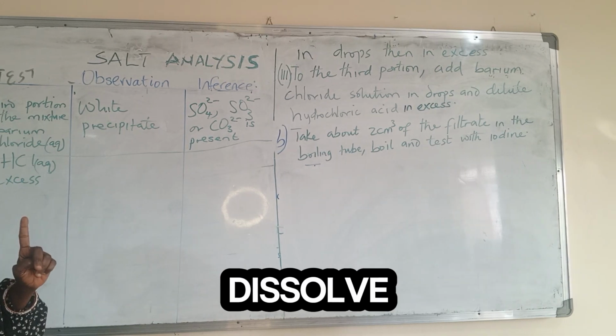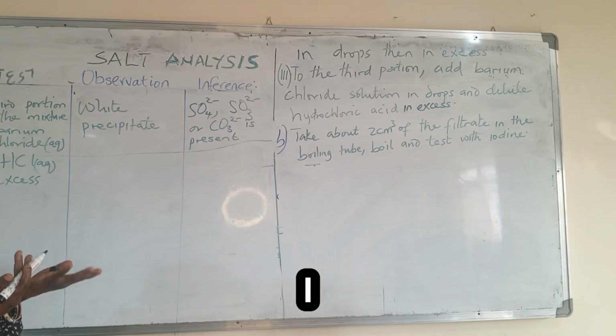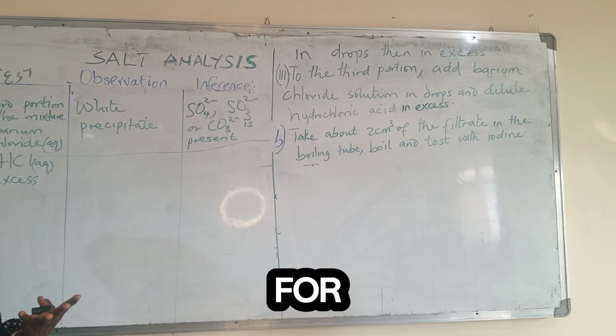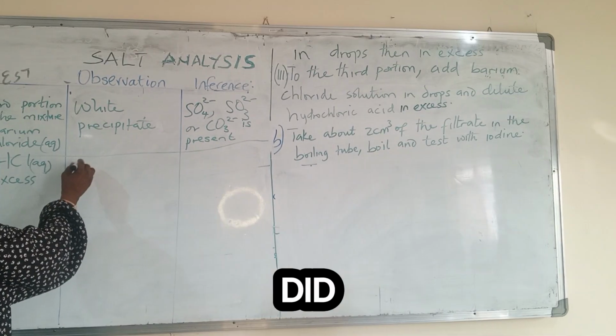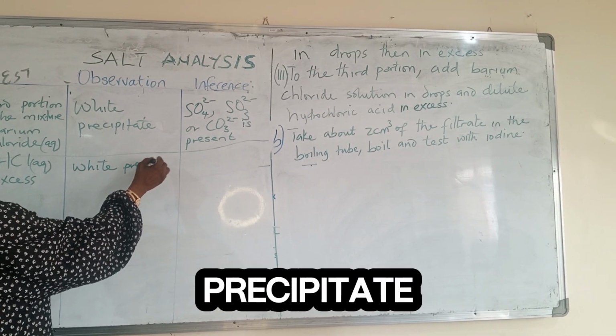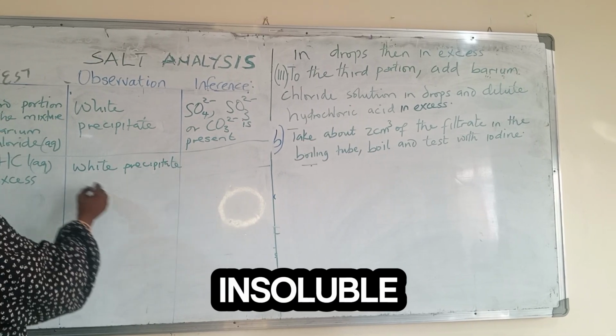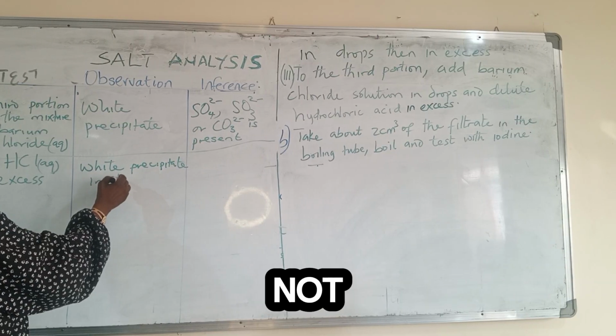If it does not dissolve, then it is SO4. For the salt we are carrying out, the precipitate did not dissolve: white precipitate insoluble, meaning it does not dissolve.